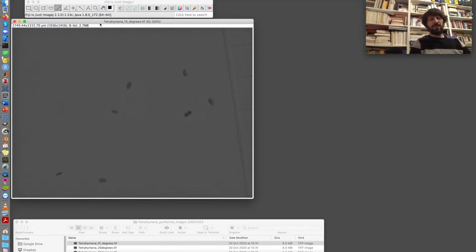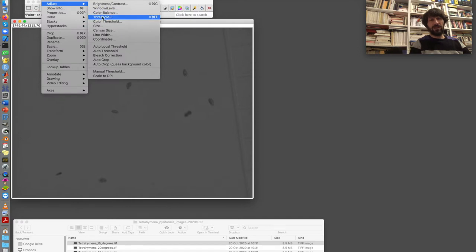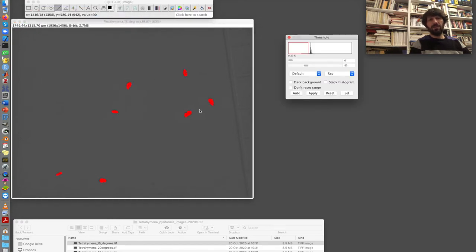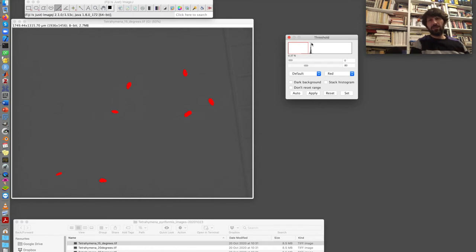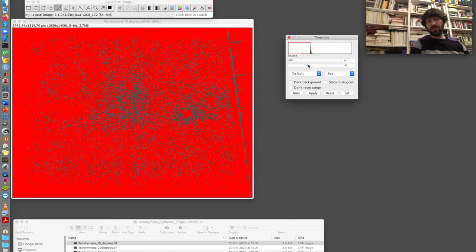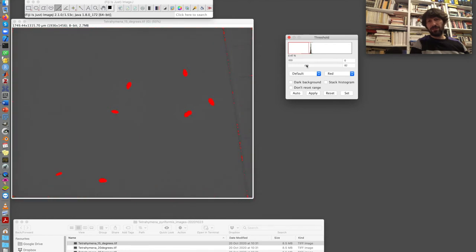The next step that I need to do is to threshold the image to separate the Tetrahymenas from the background. So I go to image, adjust and threshold. And I see here the image histogram. The peak of the histogram that corresponds to Tetrahymenas is almost invisible because they represent a small percentage of the total area of the image. There is a huge peak here, which is the background. And in fact, if I move the slider here, you can see that as soon as I go above this peak, everything is included in my threshold. So now I go back to the original value. And then I apply.